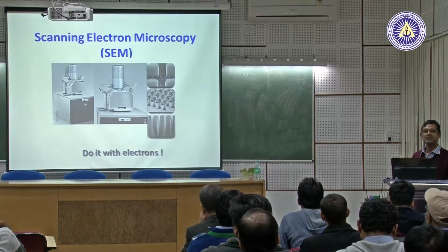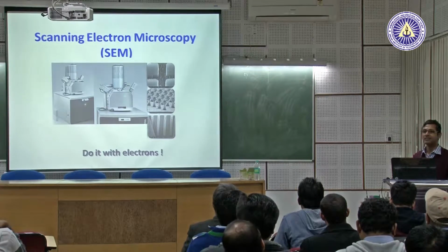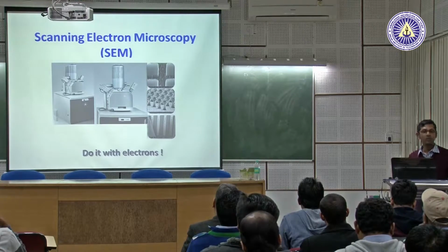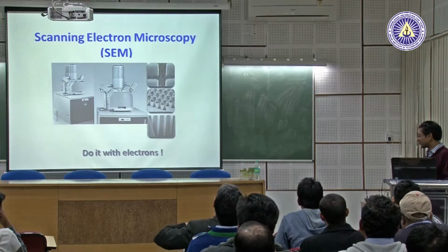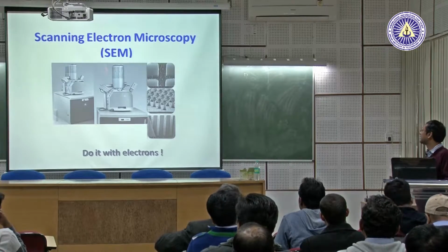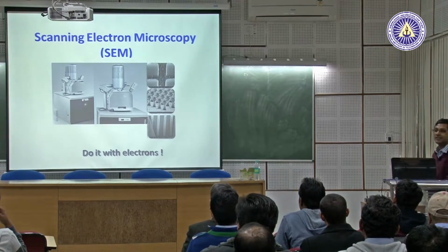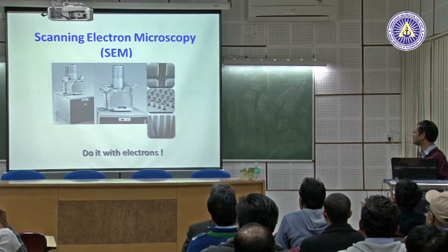We have a large number of facilities in India now in many institutes. The problem is how to use those facilities. This is the SEM we have, the latest one in our department. It is on our home page also, Nova NanoSEM.